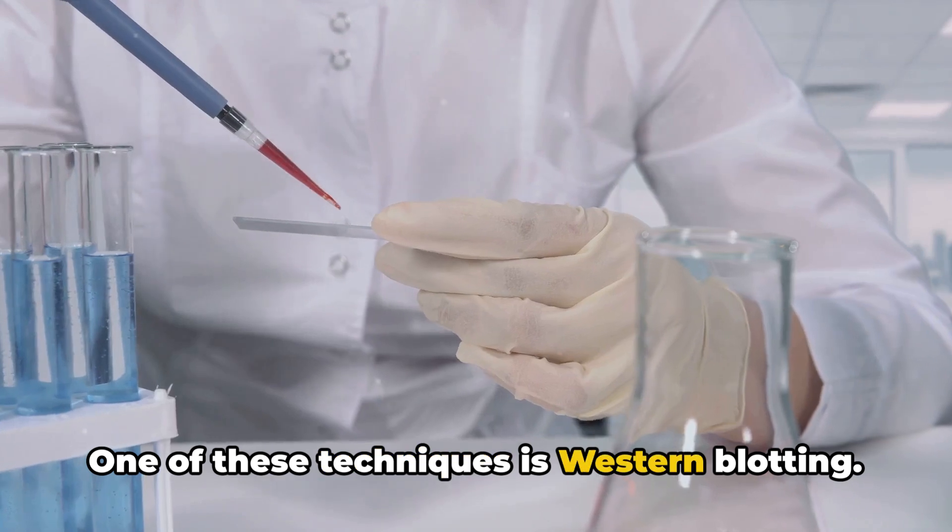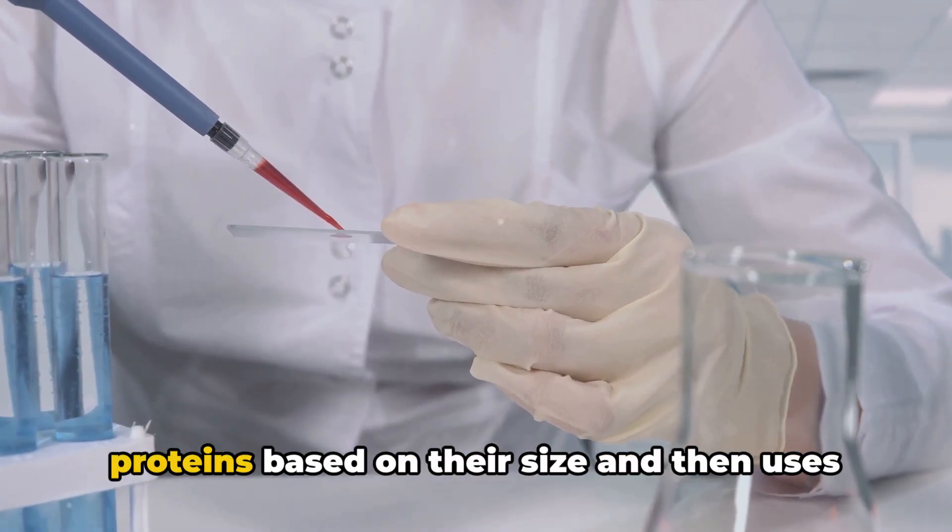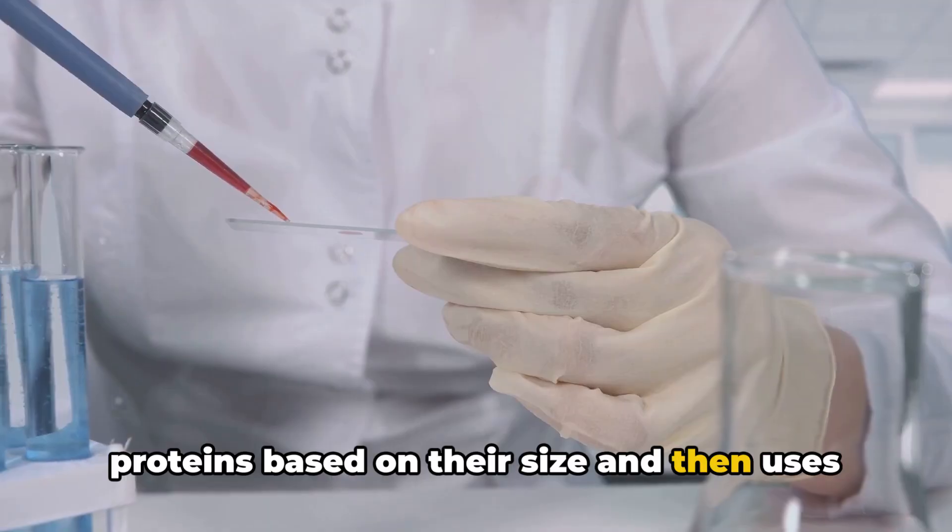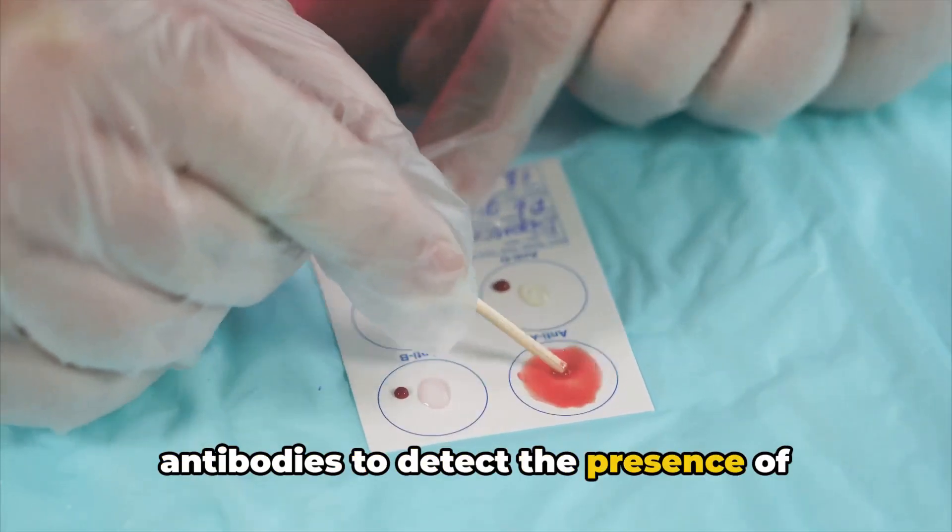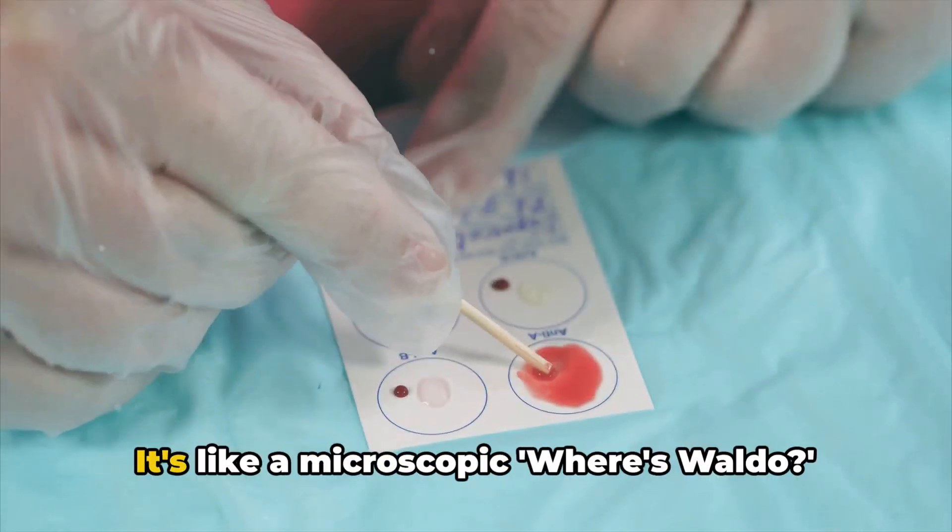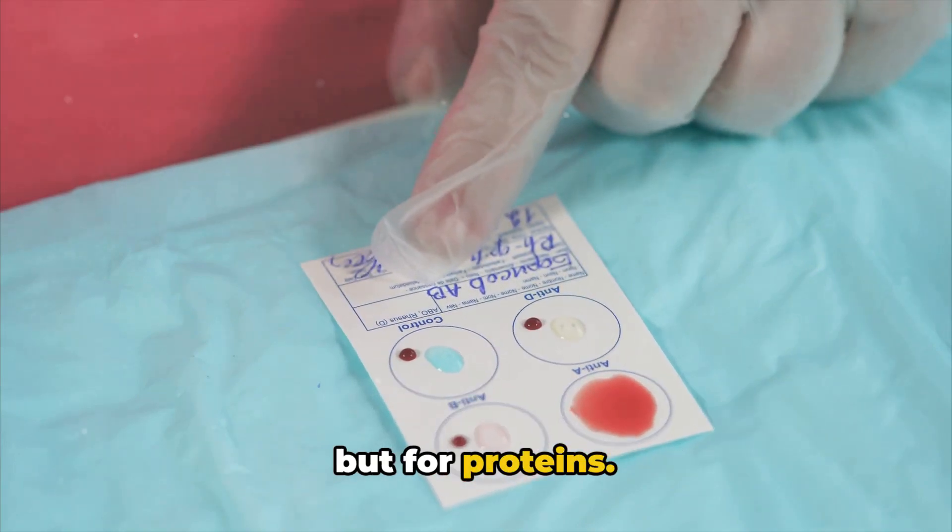One of these techniques is Western blotting. It's a powerful method that separates proteins based on their size and then uses antibodies to detect the presence of specific proteins. It's like a microscopic Where's Waldo, but for proteins.